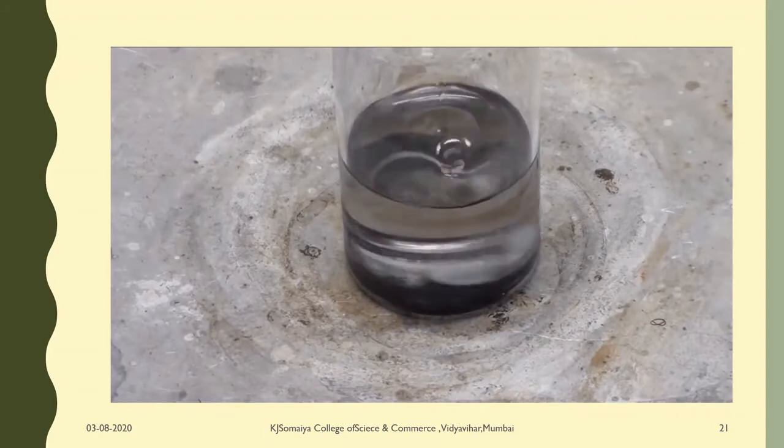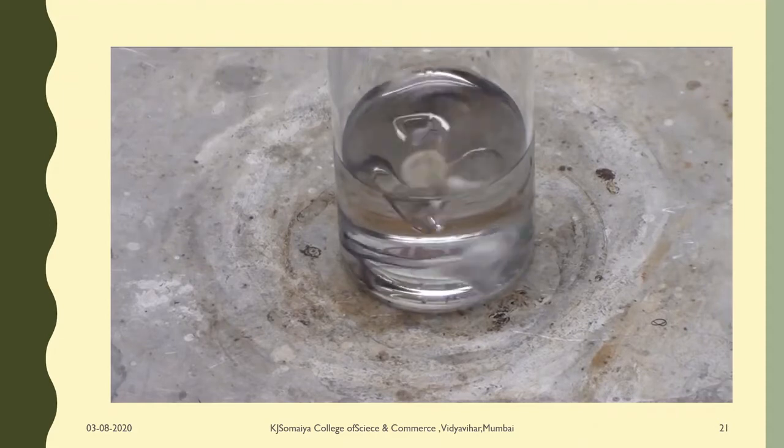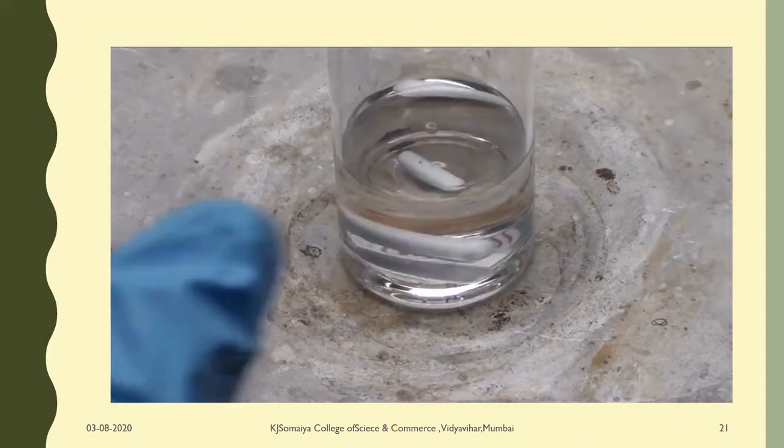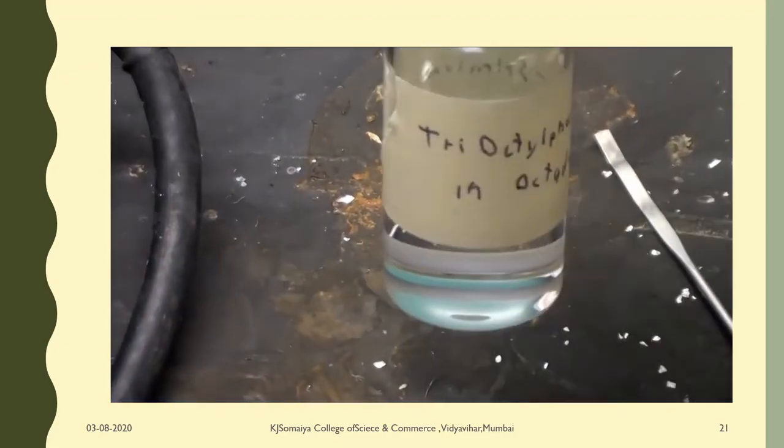Keep stirring and gently heat it until all the selenium dissolves into a clear liquid. What's happening is the tri-octylphosphine is reacting with the selenium to form tri-octylphosphine selenide. Once it's ready, seal it and let it cool. This will provide us with about 5 experiments worth.